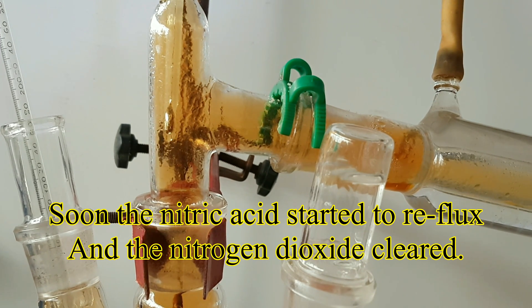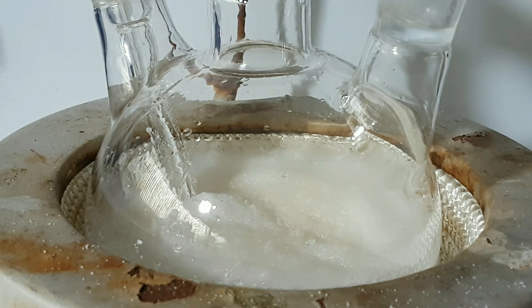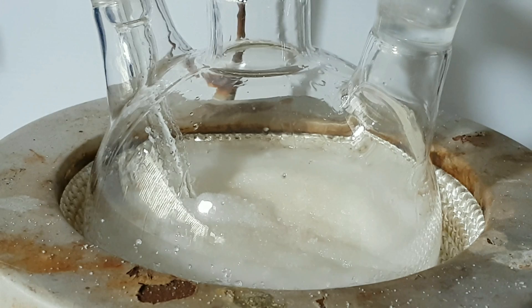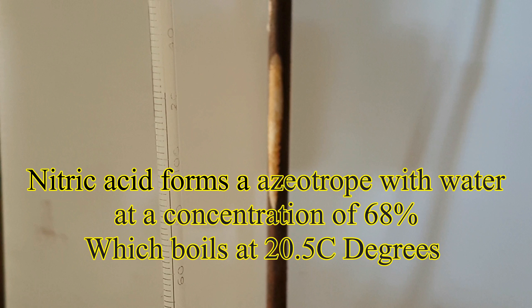Soon the nitric acid started to reflux and the nitrogen dioxide cleared. The nitric acid was condensing at 120 degrees, which seems right for 68% concentrate.